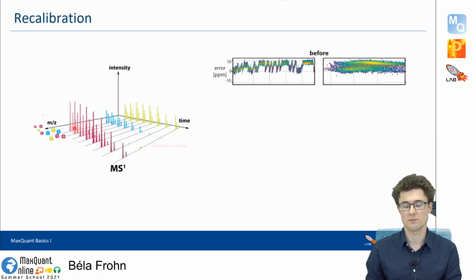For example, the origin, most of the time, is that the temperature of the room the machine stands in is changing because someone opens the door or whatever. So this is curvy, and this might first of all result in a wrong estimate of the mass, which is bad, as we have seen just now. And of course, it will give us a higher variance or standard deviation. So the window we have to look in our database is larger, so this will take longer.